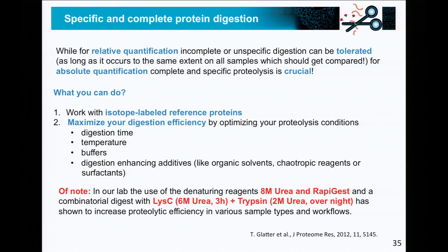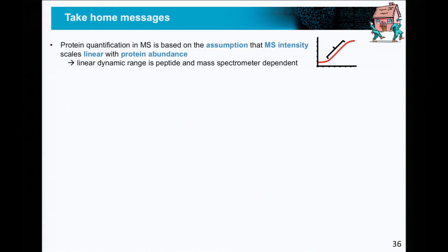And this protocol has been shown in this paper to increase digestion efficiency and to be especially valuable therefore for absolute quantification. But I don't want to say that this is the only and best way to do it. It's just something that we have found here in the lab to work very well in our hands. Okay, and that's the last point I wanted to make.